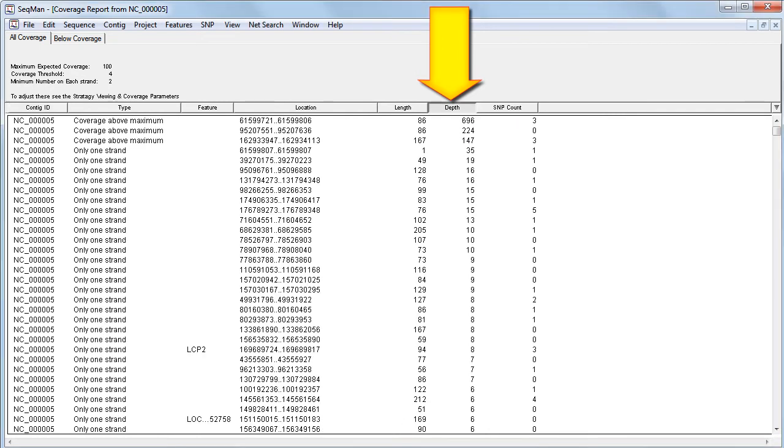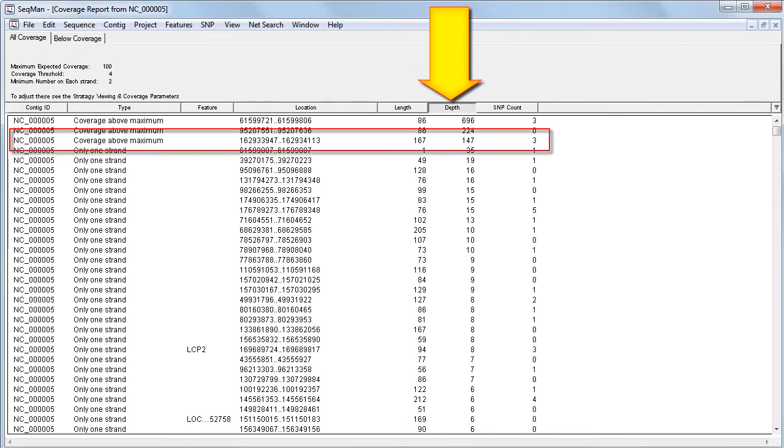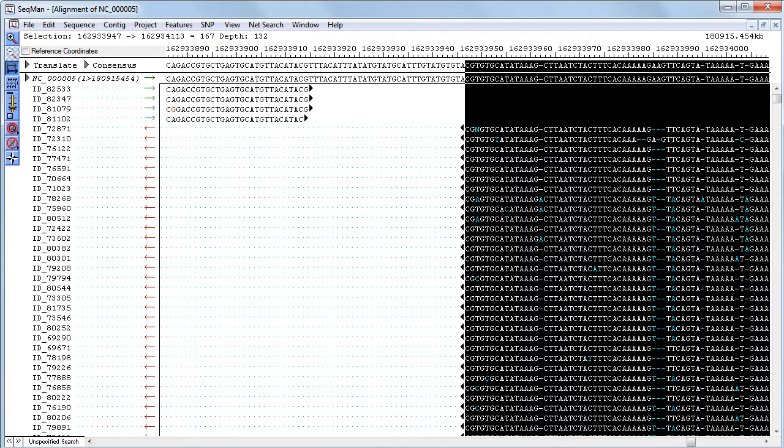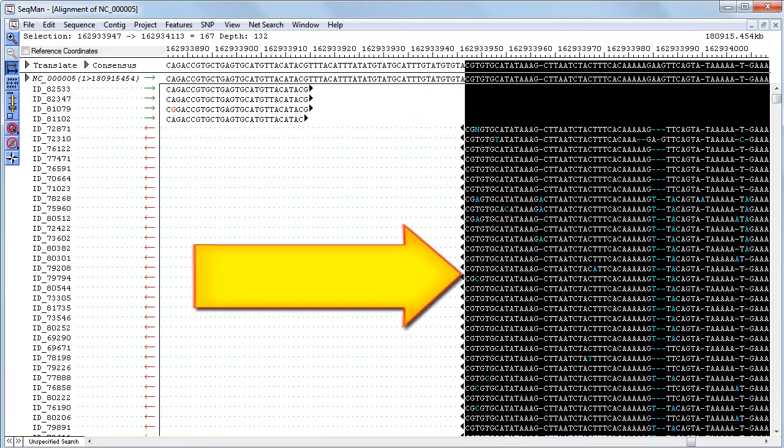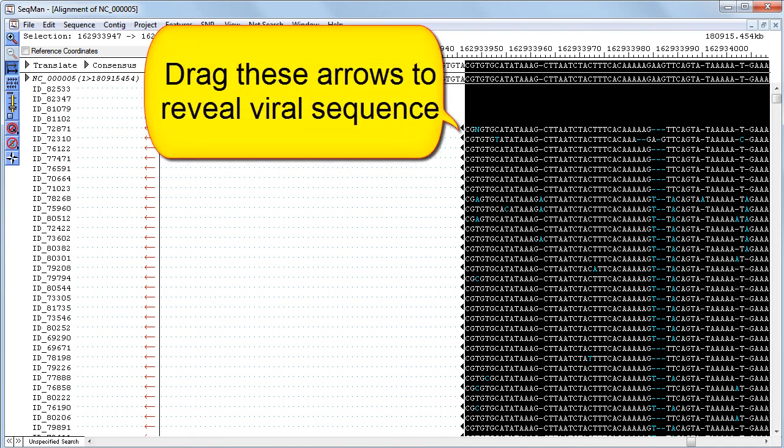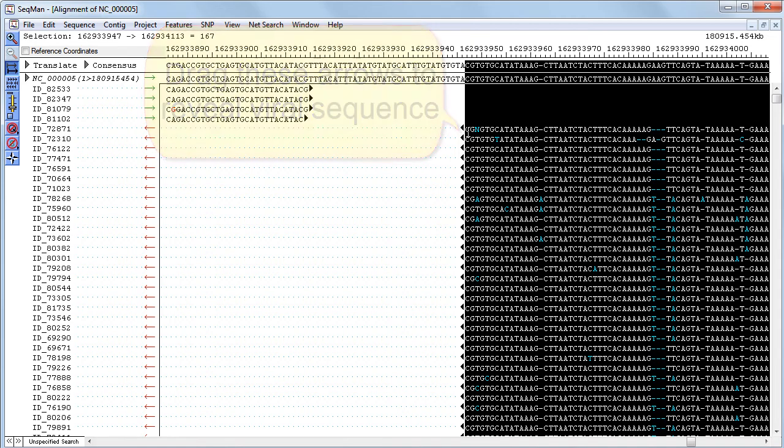I want to look at the area of the contig that has the depth of coverage of 147. So to do that, I will double click on it, and the alignment view opens with that portion of the contig highlighted. Here, our selection, which is shown in black, is the human host DNA. Notice the nice crisp endpoints, which mark where the human DNA ends and the viral DNA begins. When we drag the arrows at the ends to one side, we can reveal formerly masked sequence corresponding to the viral DNA.